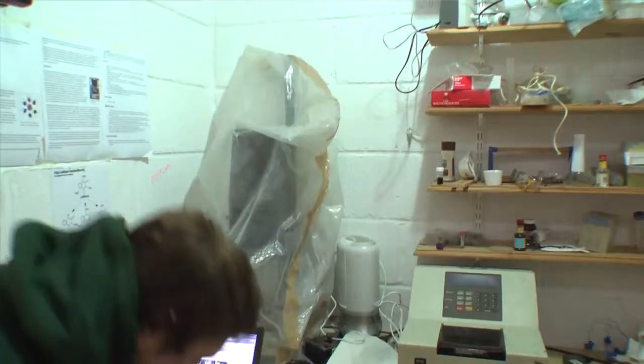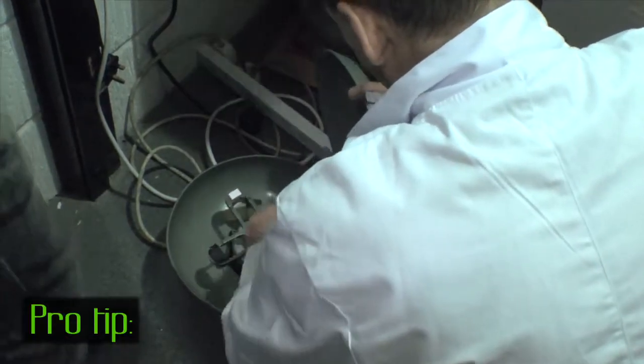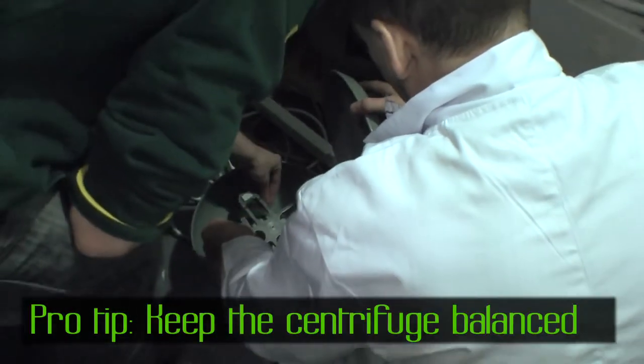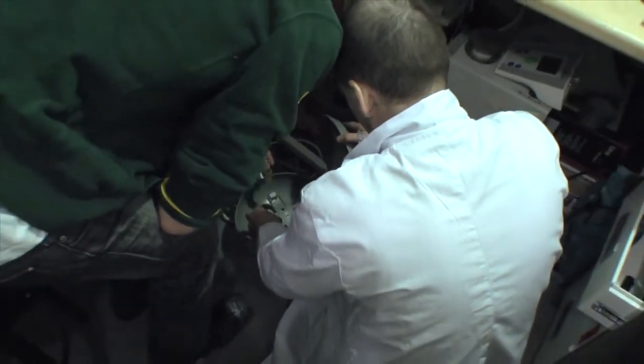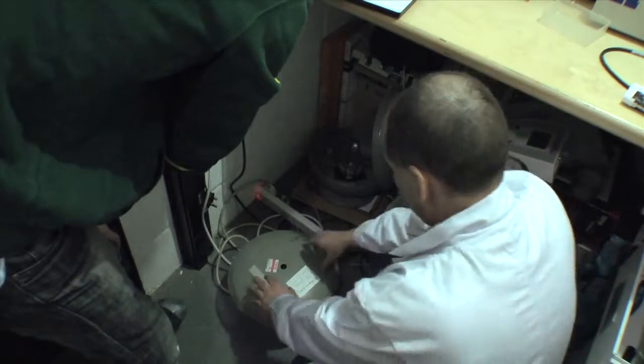Is it balanced? Oh shit! You didn't balance it, did you? I forgot to balance it, sorry. Is that the last one or is there still some in there? There's still some in there. OK, take her away. That's badass.